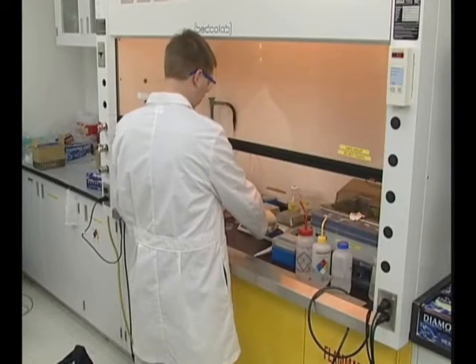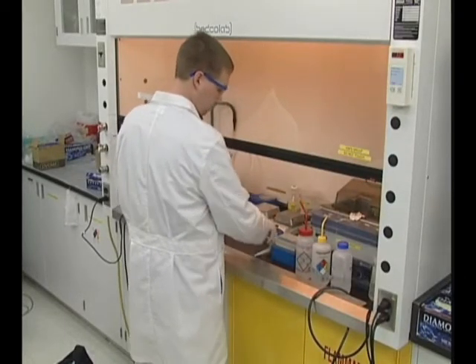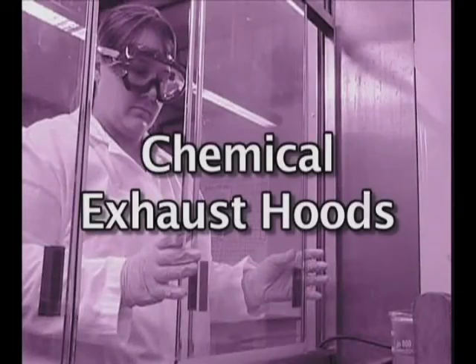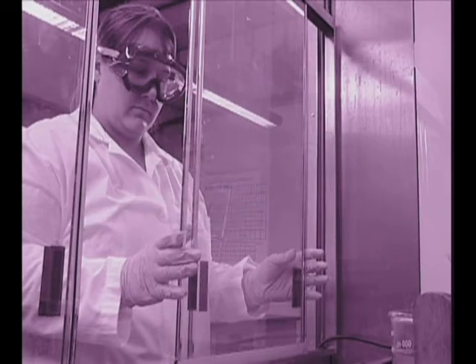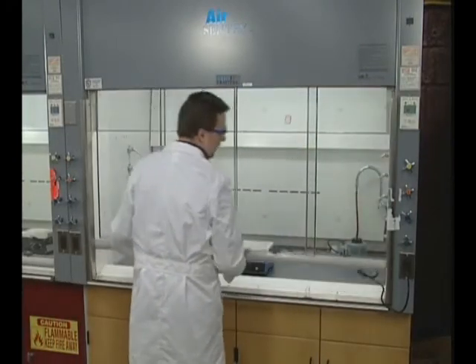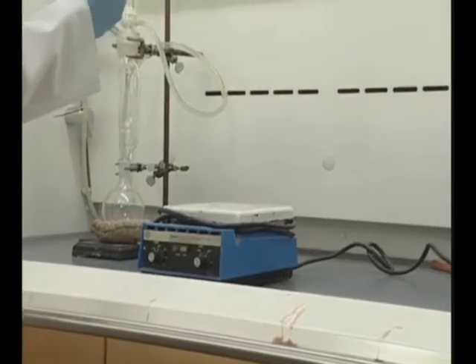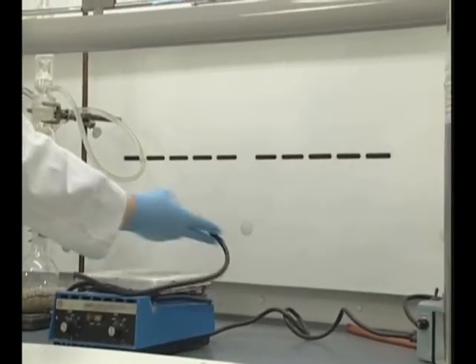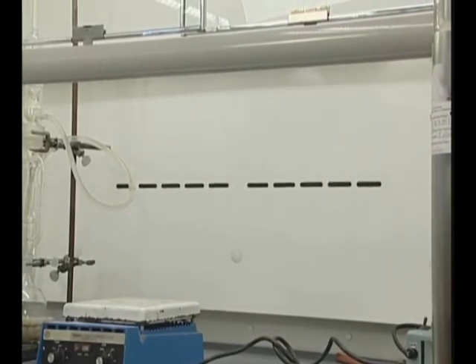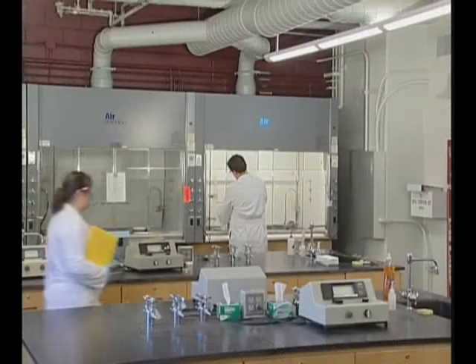We can get an idea of how to work safely with hoods by looking at one of the most frequently used types, the chemical exhaust hood. Exhaust hoods protect us by preventing contaminants within the hood from entering our breathing zone. A protective barrier is created by air that's pulled into and through the hood. This inward air flow helps keep hazardous fumes and vapors from escaping and reaching anyone outside the hood.